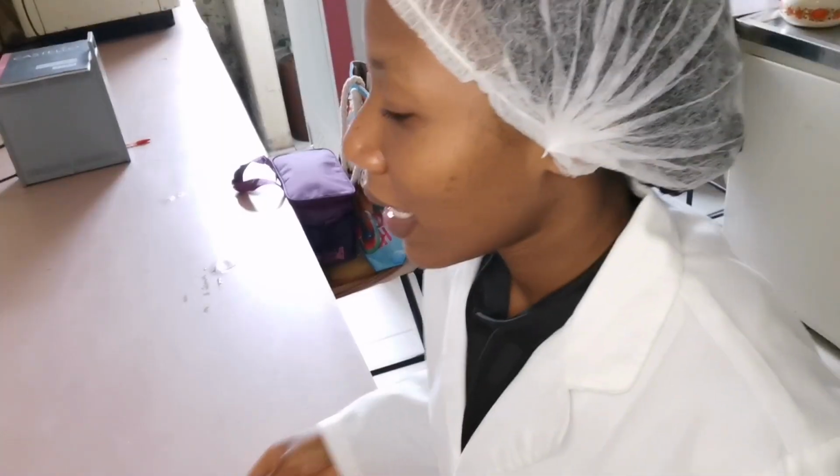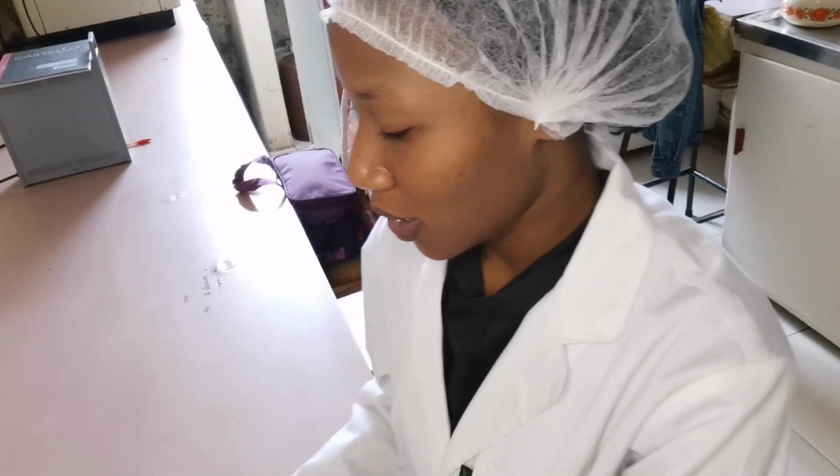That's all for now. I'm currently waiting on the milk samples to arrive so that I can perform the TBC and SCC. Guys, I'm already exhausted. I had actually forgotten about the Ekoprim situation.